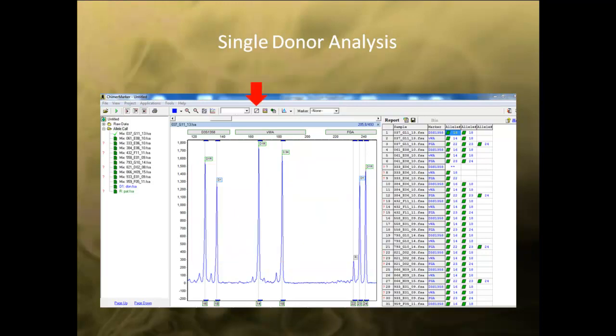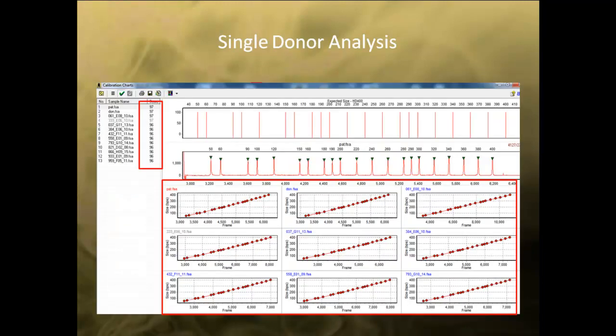You can click on the icon shown here to access the size calibration chart. The size call quality score for each sample is shown on the left, and the calibration charts are shown at the bottom. If a chart shows a linear line, it means that the size calling was good. These files are all in a linear range for size calling. If the size call for a sample needs to be recalibrated, details of the process are found in the Help menu and in Chapter 5 of the User Manual.